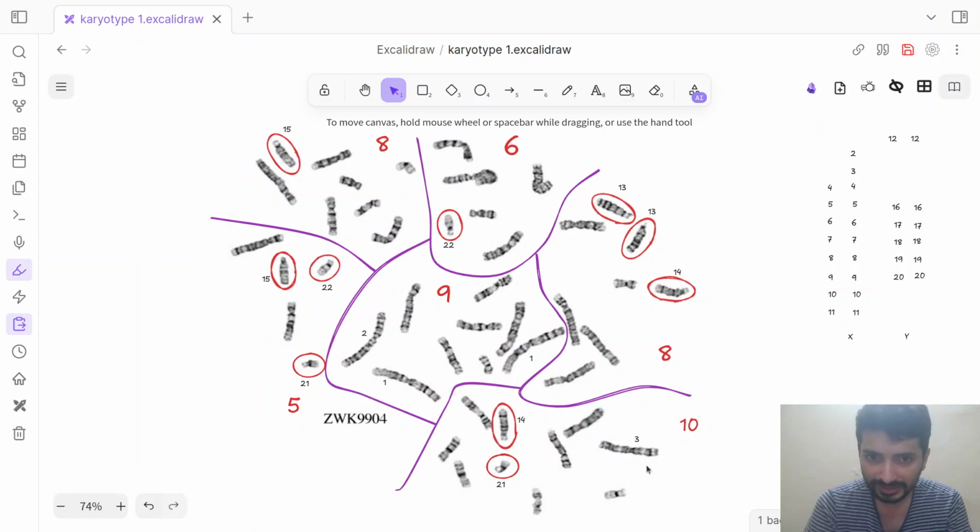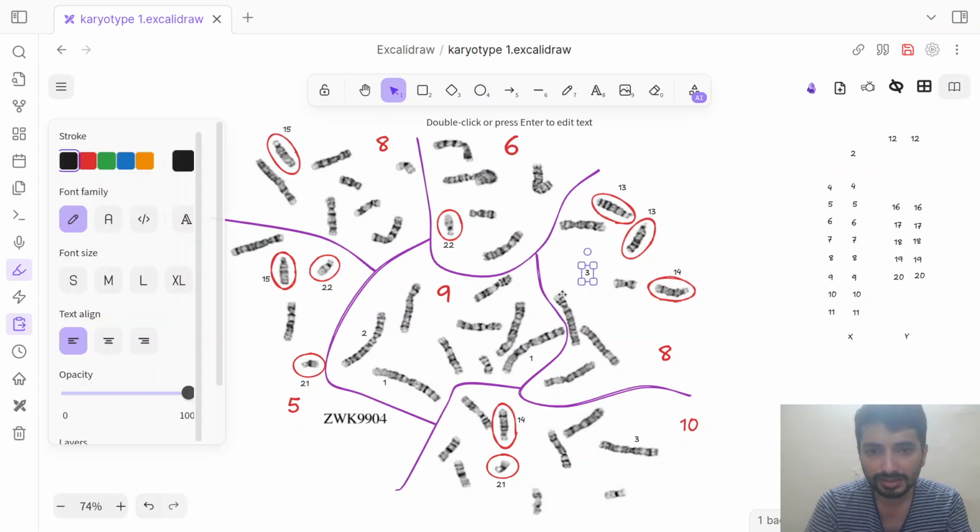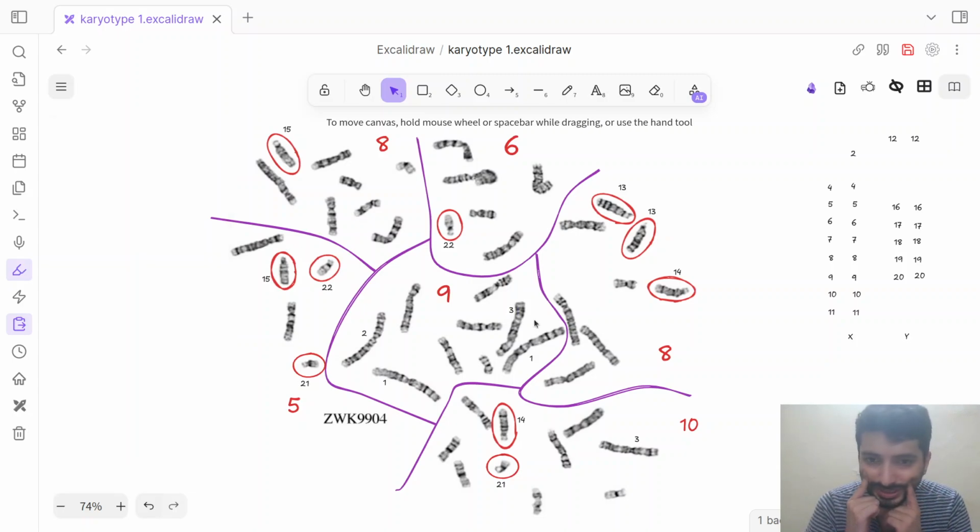And if I am to find a similar looking chromosome, I would say it is this. Again, you can see that the centromere has these dark regions, and then a relatively light section on both the arms, and then a distal dark band. So this is chromosome 3. That begs the question, where is the other chromosome 2?